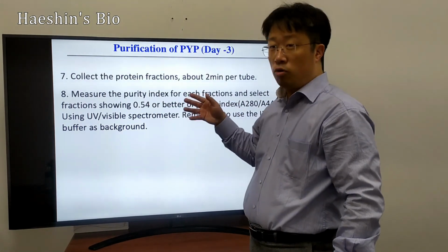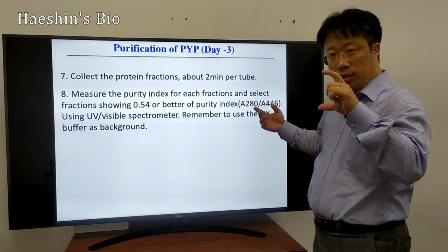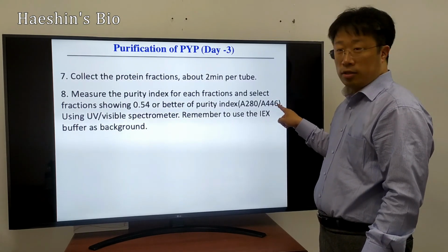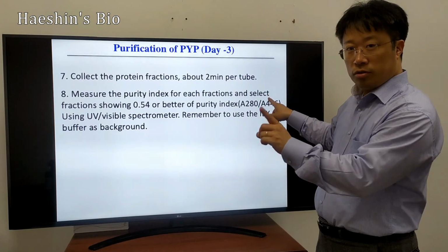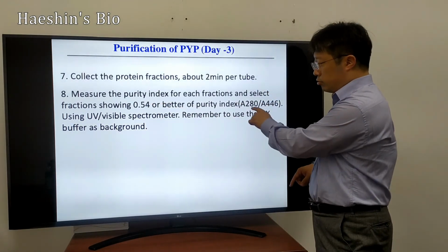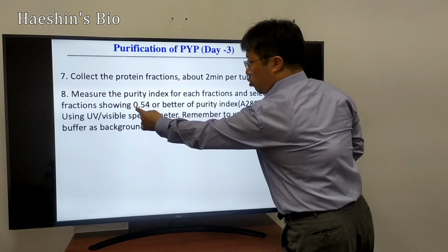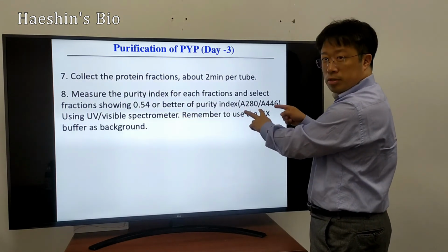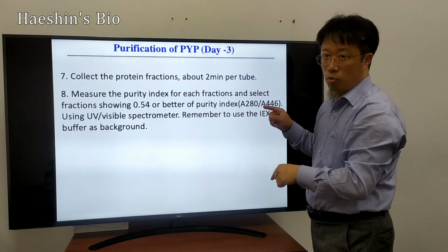We can see it, because it's a yellow protein, so we have a purity index for each fraction. Yellow proteins have absorption in the visible range, about 446 nanometers. This is what we want to purify. This is the evidence that the tube has the target protein. So we measure this for each tube, along with absorption at 280 nanometers, which every protein has because of tyrosine and tryptophan. And then this index becomes lower than 0.5. This is a practical number, not important, but a lower index is better, because the PYP-specific signal is higher for a given protein. So as this index gets overall lower, the purity is higher.